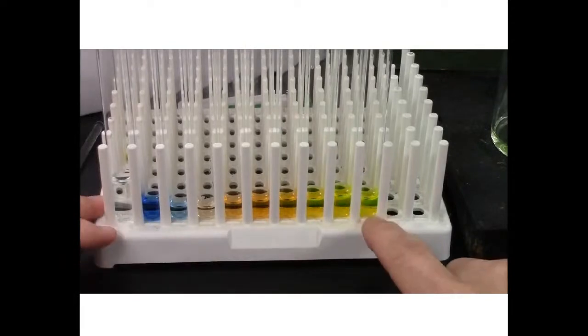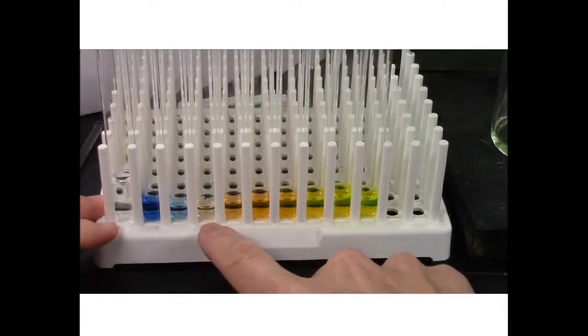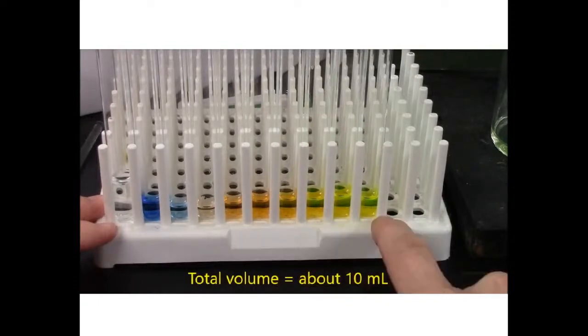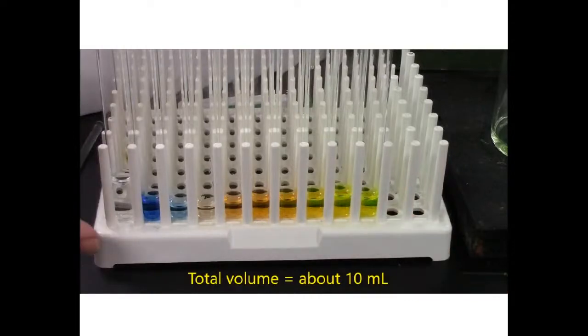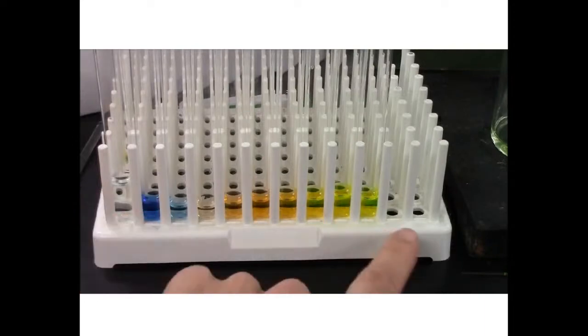Fluorescein stopped coming out right about here. So the total volume will be 2.5, 3.5, 4.5, 5, 6, 7, 8, 9, about 10 milliliters, which is what I would expect for a column of this size. Often what you want is just this first fraction with the large molecules. If you're trying to desalt a protein or remove the unbound label from a protein, then this is the fraction that has value. These fractions would just be junk.